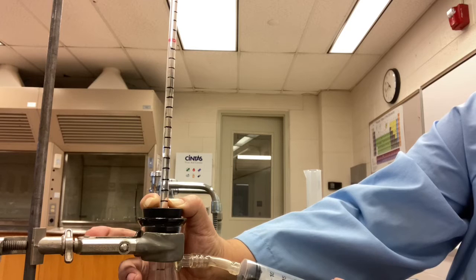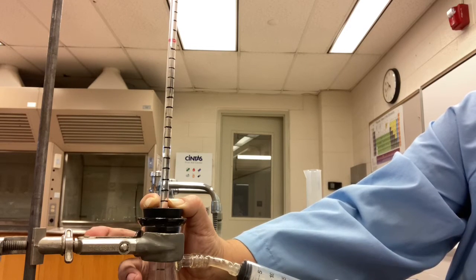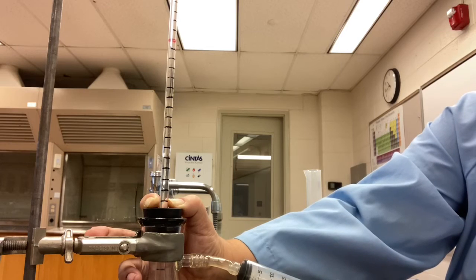And then closed will be 46.5. So when it's at 0, it's at 46.5 centimeters. So you should have all of your data for column C filled in at this point.